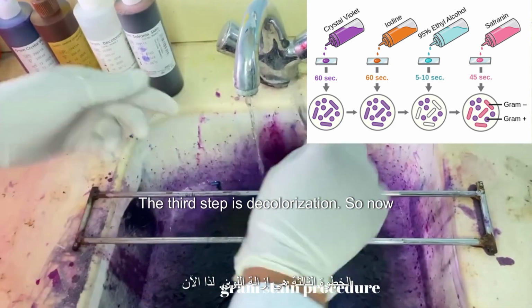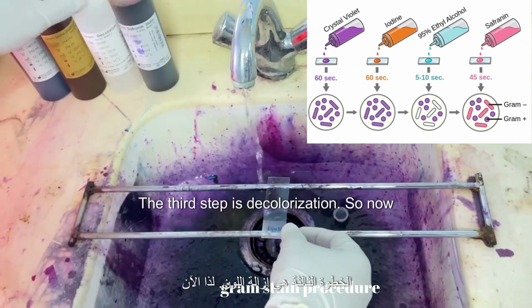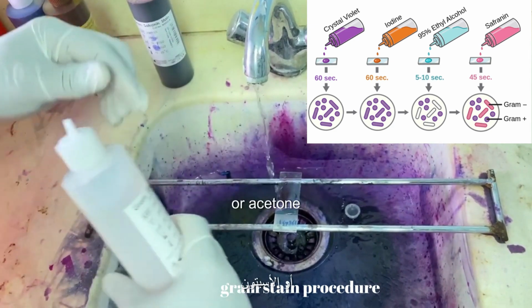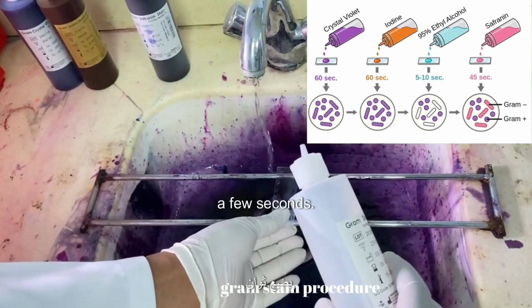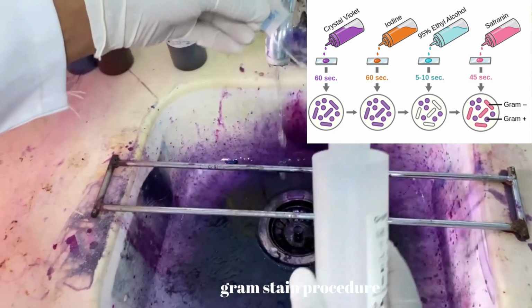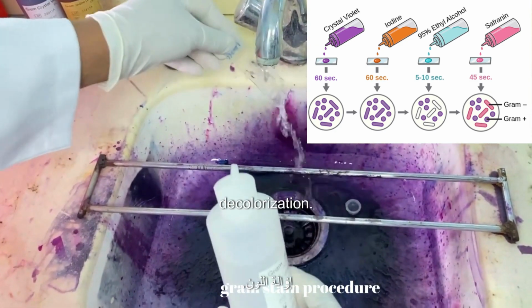The third step is decolorization. So now we apply alcohol or acetone for a few seconds. Then we rinse with water immediately to stop the decolorization.